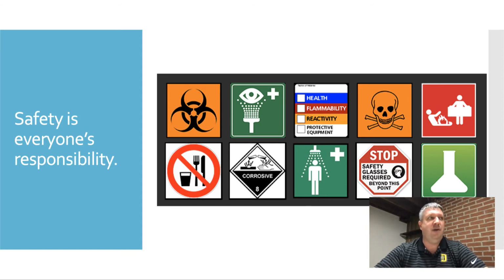And I always find it kind of funny when he does show up and the students are like, Mr. Guerra, you can't be in here without your goggles on and an apron and gloves and a hard hat and whatever else we can put on them at that time. But really, guests, faculty, students, everybody has to practice safe practices at all time.